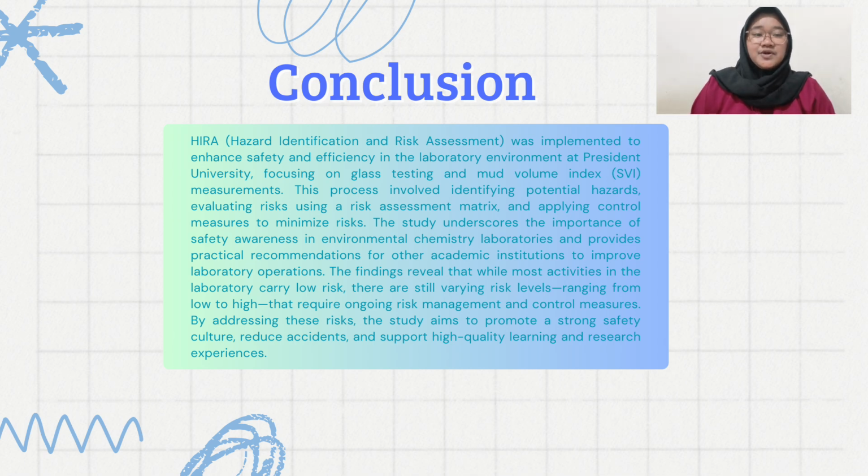Additionally, ergonomic conditions were enhanced, which made it more comfortable for employees to perform extended activities. Additionally, no incidents of chemical exposure were reported during the study, demonstrating the effectiveness of the safety procedures.